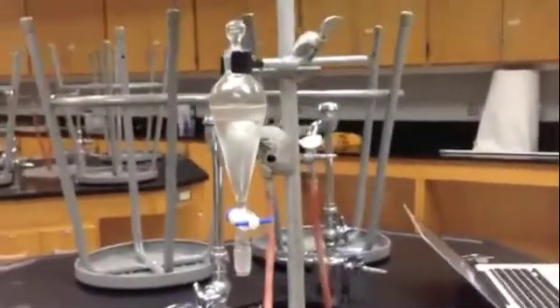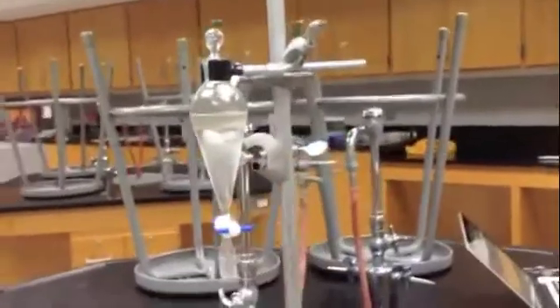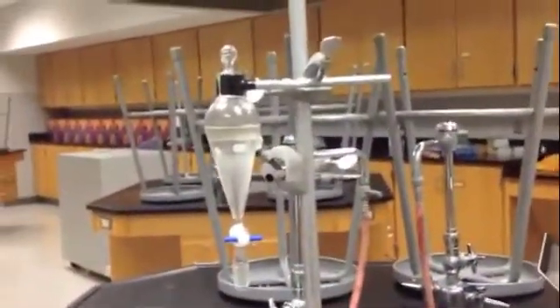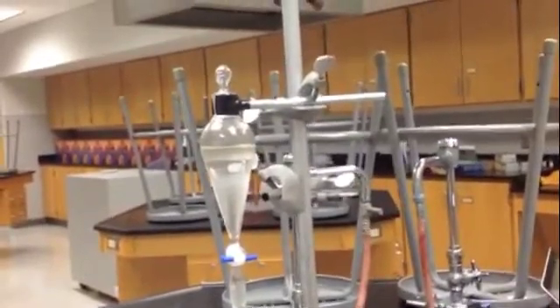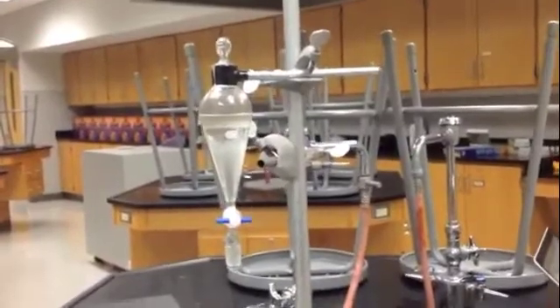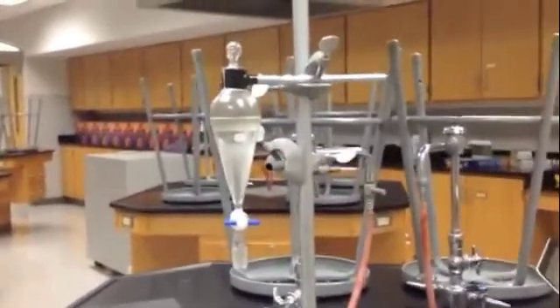My product has started to cool down now, and you can see there's two different layers here in my separatory funnel. We've got water down below, and the organic product - the ester - up above. So I'm going to let this cool off a bit more, then I'll decant the water off and distill off the product.